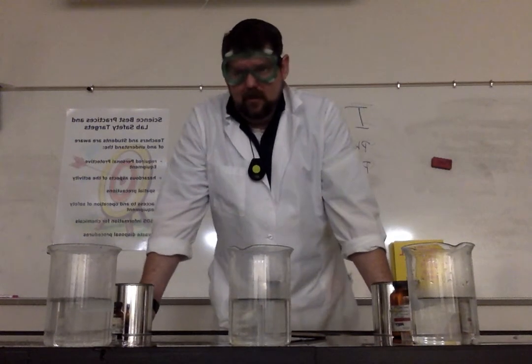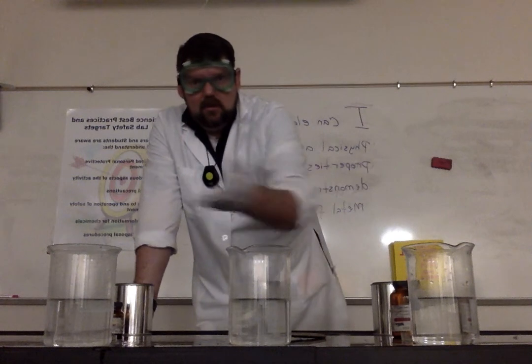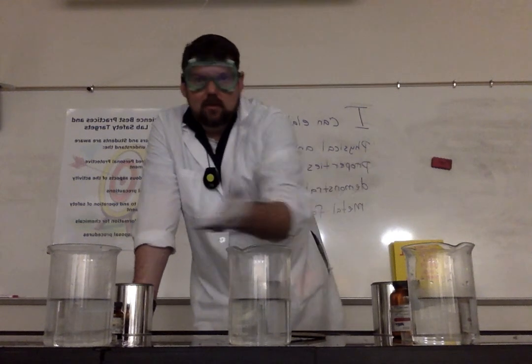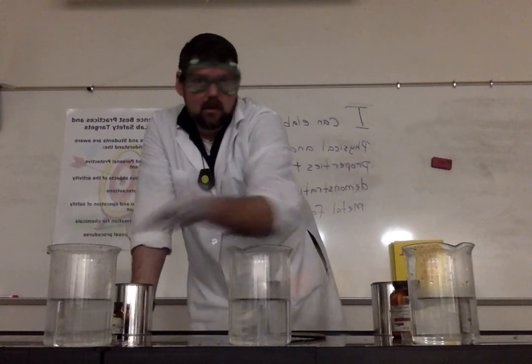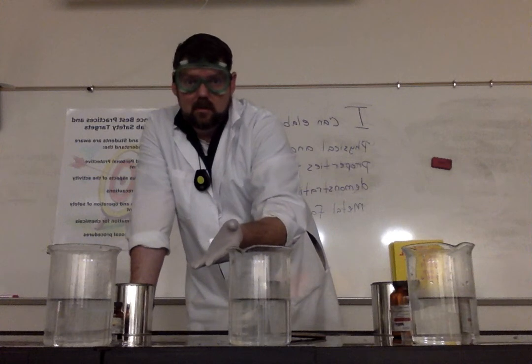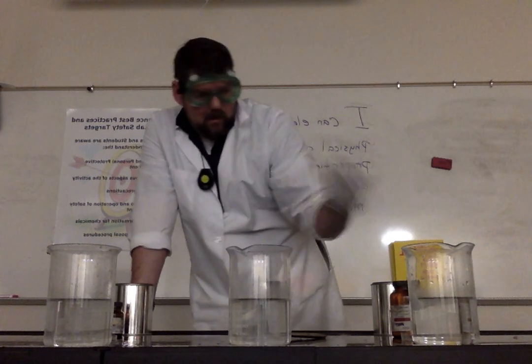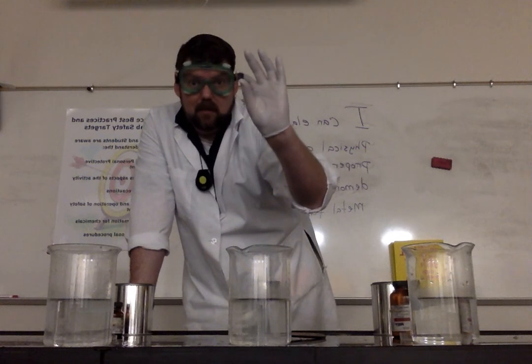So hopefully, by looking at all this, we now have new substances, new physical properties, new chemical properties. Clear, clear, clear. All similar. They're all bases, all corrosive, but started from something totally different and something that's considered a metal.